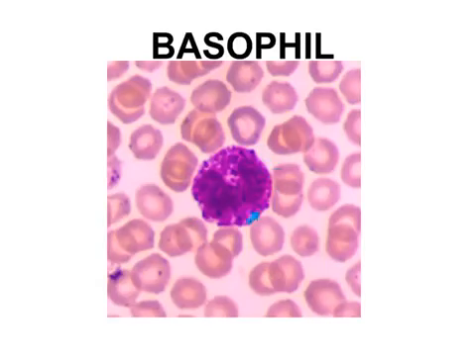Here we have a basophil. Now with the basophil, one of the things we want you to see is that this large stained deep blue to purple color that we see often is so numerous that it masks the nucleus. And so the nucleus is not clearly identified here. It will look much more grainy in appearance.